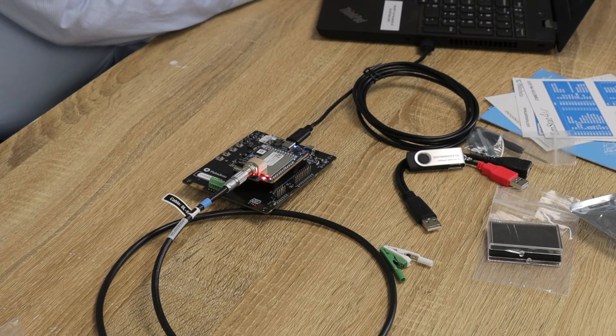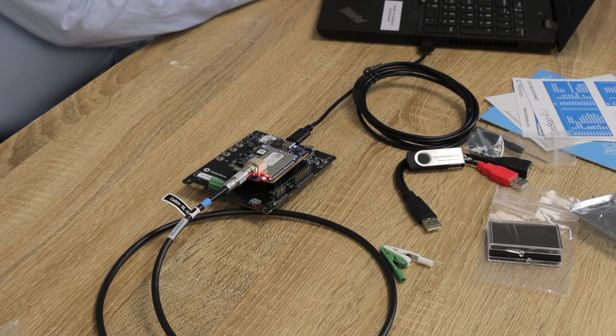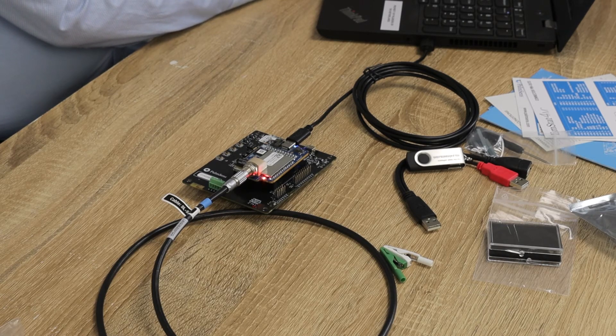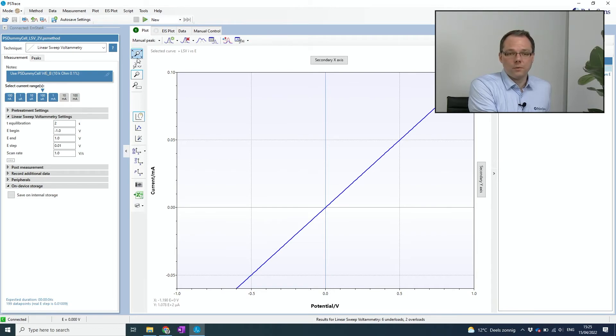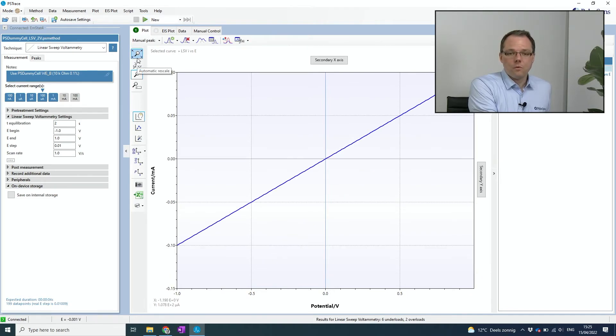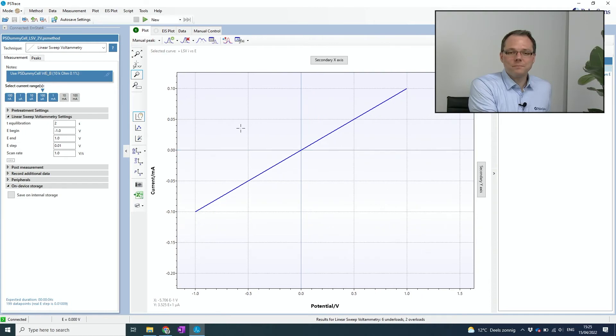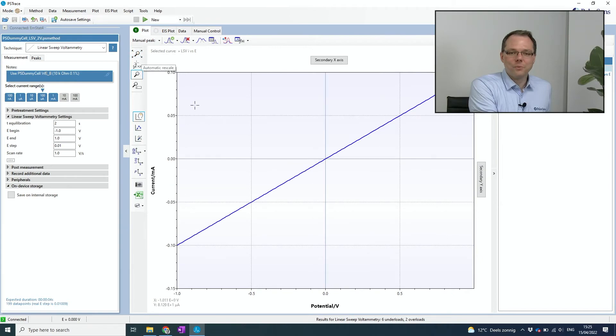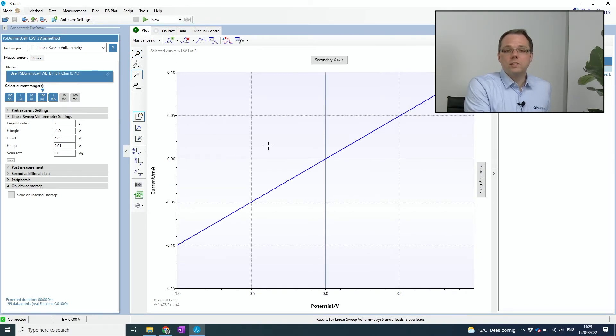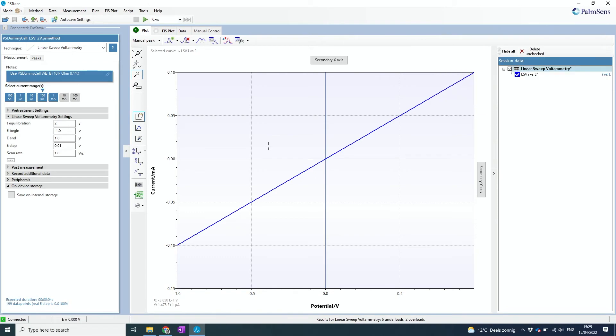And you see that on the potentiostat you have a red LED that indicates that the cell is on. Right. So here we already see our first measurement, which is a diagonal line. Oops, now I zoomed in. There we go. Which is a diagonal line which is expected from a linear sweep voltammetry on a resistor. Okay, so you see within a few minutes you can unbox your potentiostat and already do your first measurement.